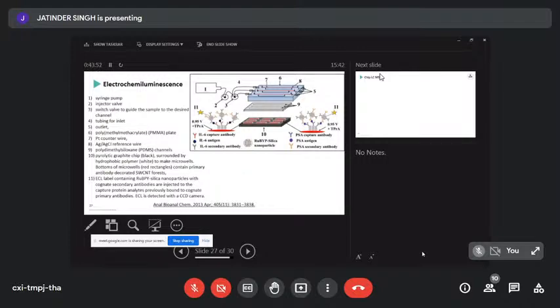where again they got a setup here. So they've got a syringe pump that's connected to two different valves to get the sample into three different channels. There's tubings. The microchip contains a top plate that's made out of PMMA. Where are we? There are some electrodes for generating the electrochemiluminescence, a reference electrode because it's electrochemistry. We've got a PDMS substrate here, which has got the microfluidic channels to control the flow.